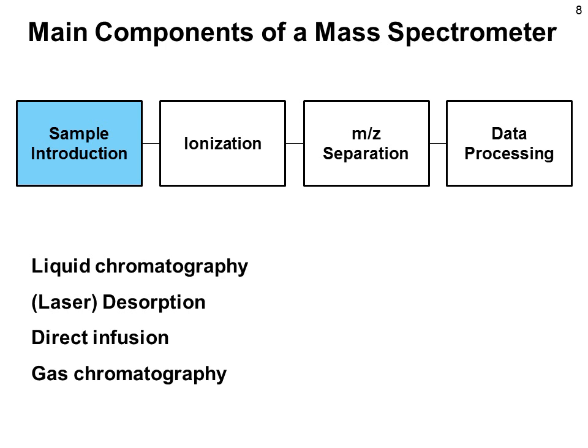Finally, and originally used, gas chromatography can be used. Gas chromatography is ideally suited to combine with mass spectrometry, as the molecules are already in the gas phase. They just have to be ionized to be introduced and analyzed by a mass spectrometer.